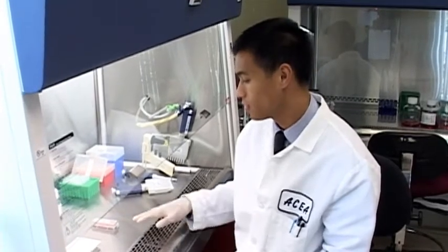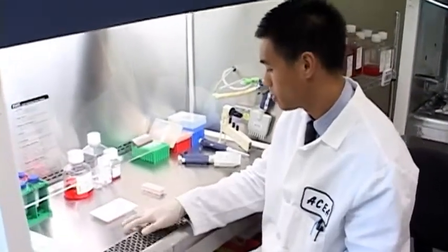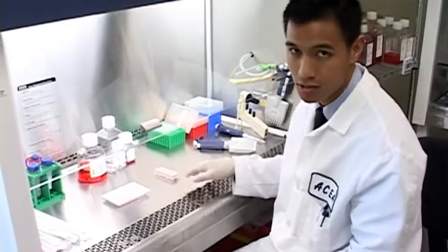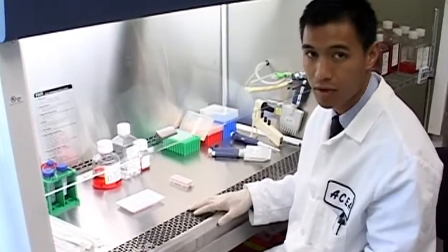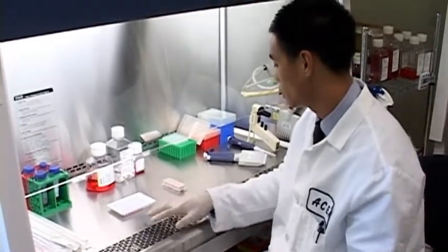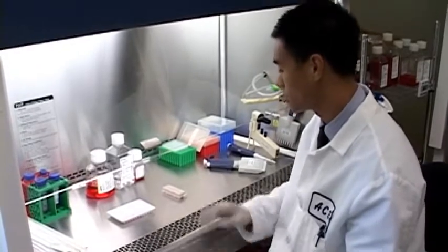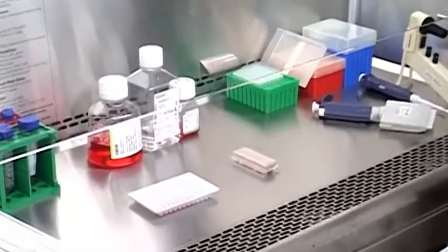Now, yesterday we plated 150 microliters for the background measurement, as well as 300 microliters for cells, which gives a total volume inside the E-plate per well of 450 microliters. Today I'll be adding my compounds, which I have prepared here, at 50 microliters to this 450. So the final volume will be 500 microliters. And so I have prepared my compounds at 10x, such that once I add 50 into 450, it'll be a 1 in 10 dilution, and your final concentration will be 1x.